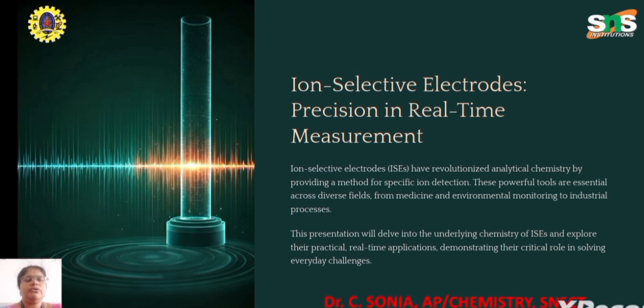In this video, we are going to see about ion-selective electrodes, their precision and real-time measurement. So what is this ion-selective electrode? These ion-selective electrodes have revolutionized analytical chemistry by providing a method for specific ion detection. So, the presentation will dwell into the underlying chemistry of the ion-selective electrode and explore their practical real-time applications. These powerful tools are essential across diverse fields, for example, medicine, environmental monitoring to industrial processes.